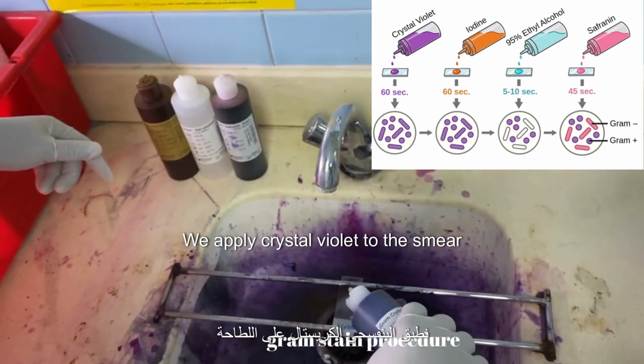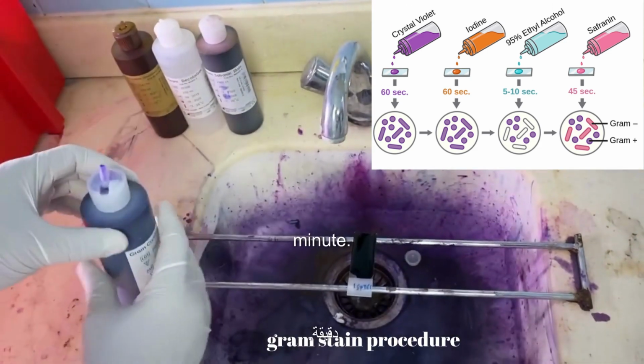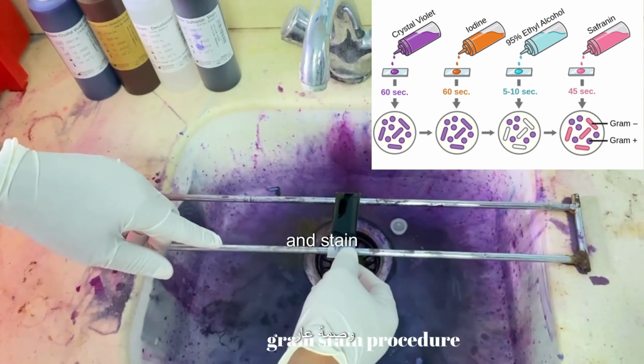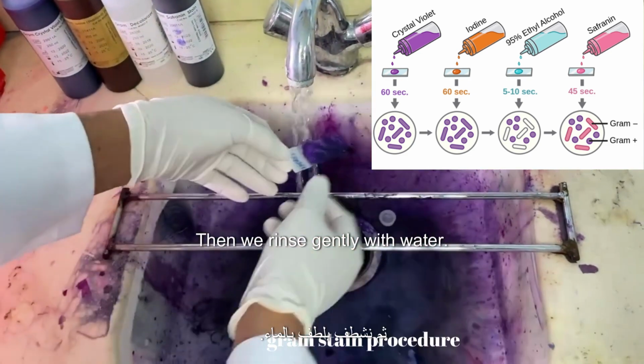We apply crystal violet to the smear and leave it for 1 minute. This dye penetrates the bacterial cell wall and stains all the cells purple. Then we rinse gently with water.